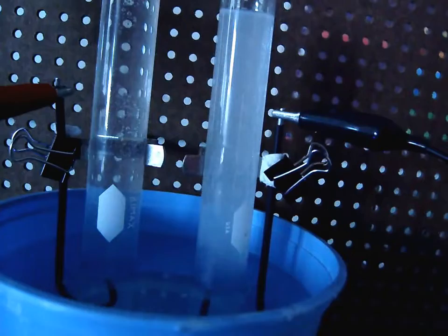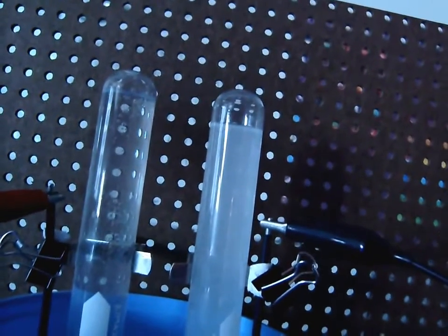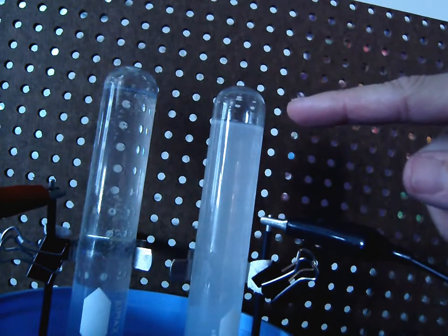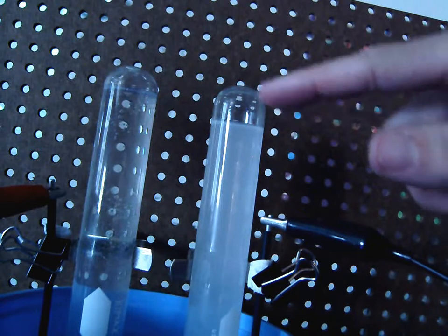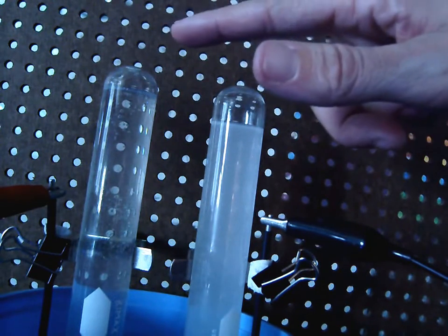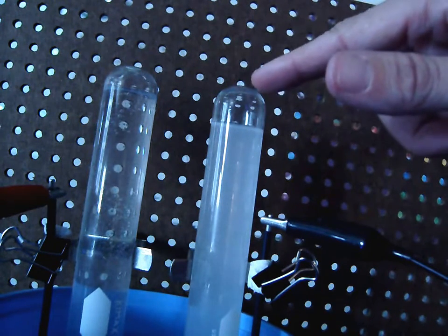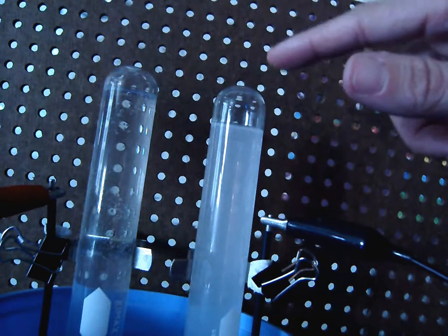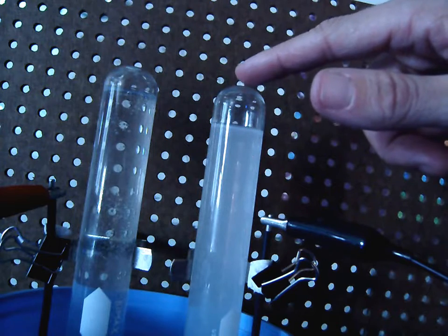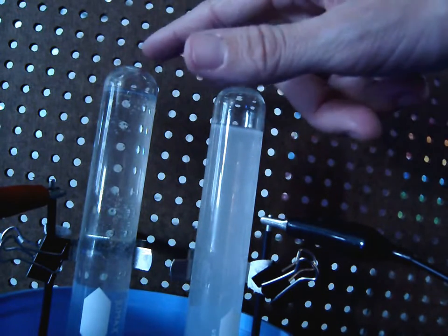Now, let's see if we can see what's going on here. Okay, if you look at the top of the test tube, you can see that this test tube has already collected probably twice the amount of gas as this test tube. Because at the beginning they were both completely full of water, and as the gas rises up to the top, it's going to push the water out. So this seemingly empty space at the top is actually a gas that's being collected. So this gas, whichever one it might be, is being collected in twice the amount of this gas.